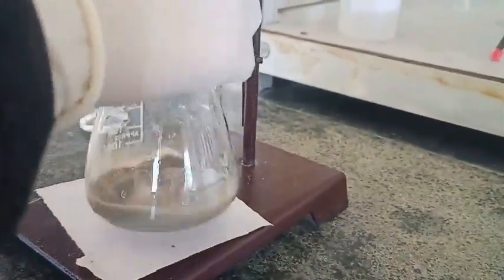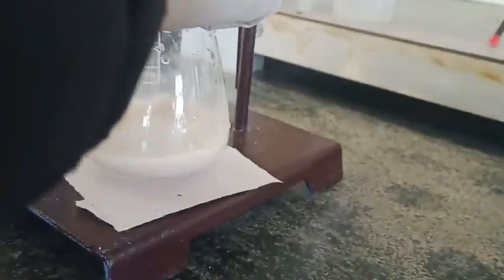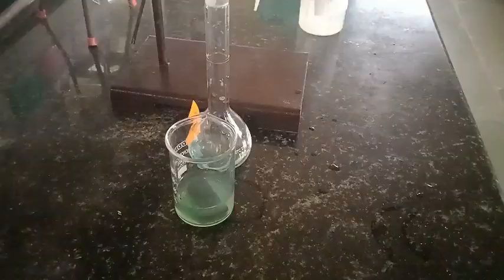Now I am going to add 10% KSCN solution, potassium thiocyanate solution, just to ensure that all the iodine which is present in the complex form is released and titrated against the sodium thiosulfate solution. Now you can see the end point, 23.6 ml.